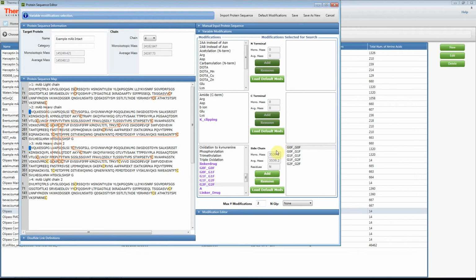Now one tricky thing is you don't want to use these for peptide mapping. If you look for the glycans this way as variable modifications in peptide mapping, what is very important to know is that it's not going to think of them as glycans. It only recognizes them when you do it the database way.